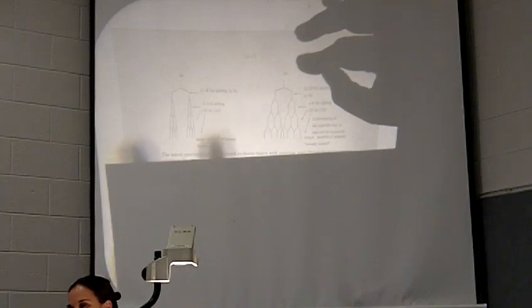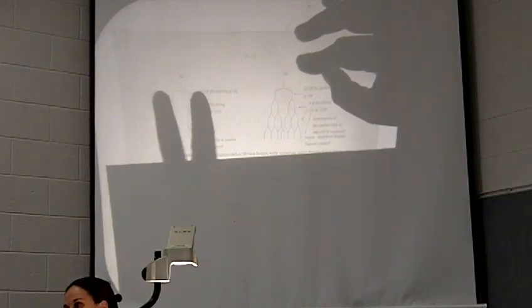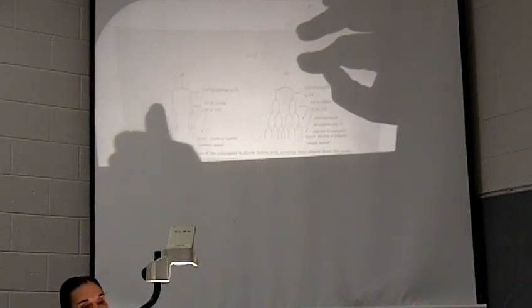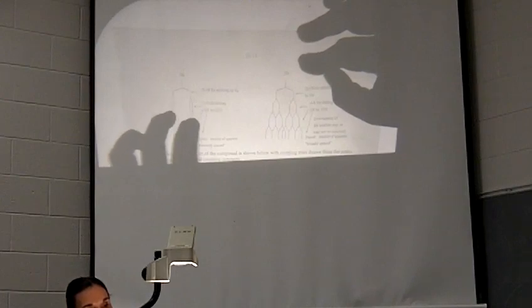Have you guys covered the n+1 rule yet? So that makes sense as far as n+1. There was 1 proton, but yet you see 2 peaks there, right? A doublet. But then this signal goes on and splits more because of that methyl group. It splits once for each of the protons in the methyl group, so 1, 2, 3.